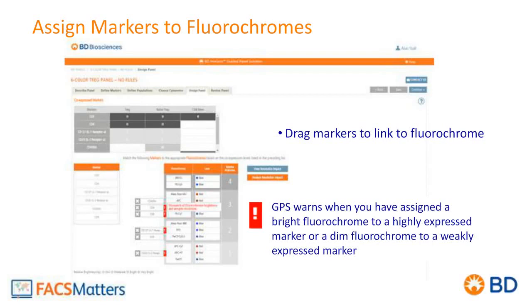So what it does is, once you've now put all this information in, you can see in the upper area, you have the critical populations you defined. In this one, it was T-reg and activated T-reg. It shows you what co-expressed markers are there and the expression level. So you can now use this information to already choose what you want to do. And again, what I say is the software at this point does not tell you what reagents to choose, but it tells you where you might have problems. And you can always override the software and say, this is what I want.